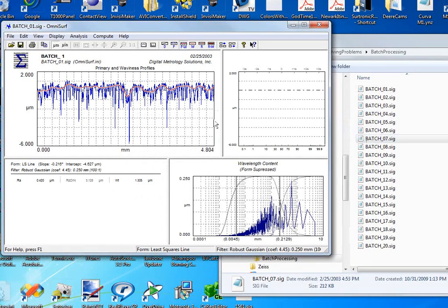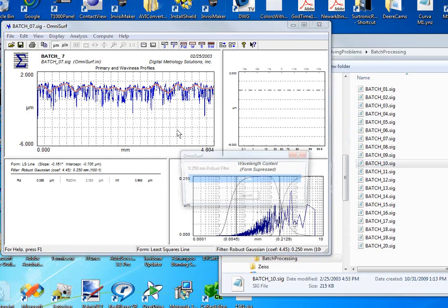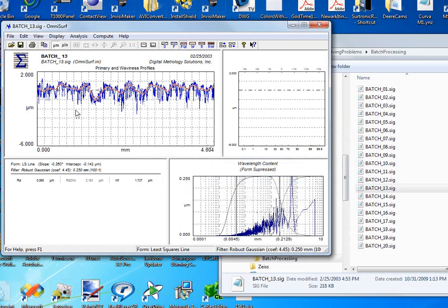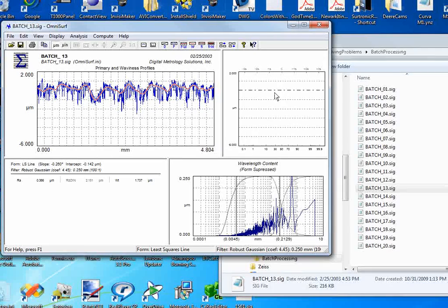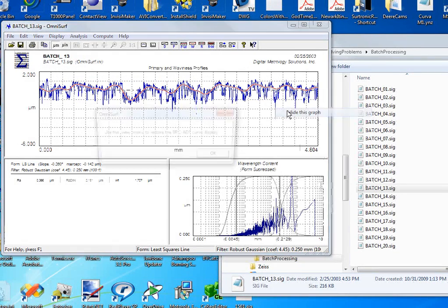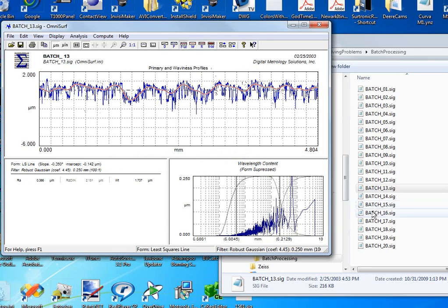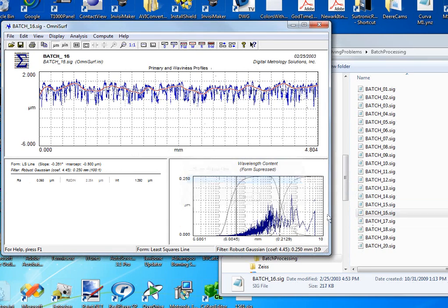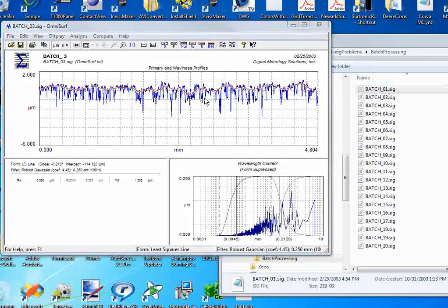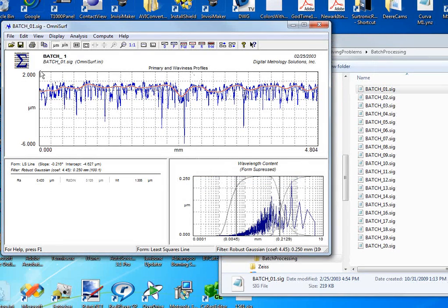Now I'm in a situation where I can quickly drag and drop my profiles and look at them and see what's different between them. The bearing ratio curves aren't doing much for me, so I'm going to right-click and hide that graph, and I have a nice big view of my profile. This has made my life much easier as I can drag and drop and look at differences in the profile graphs.